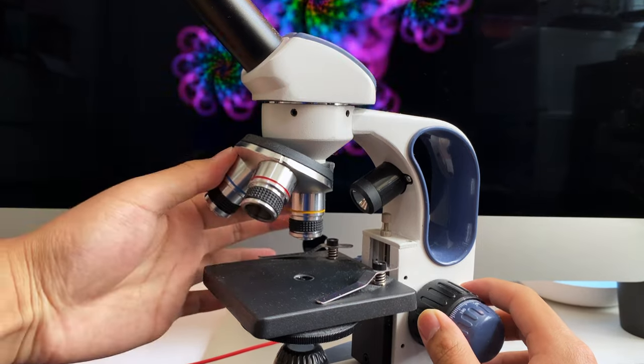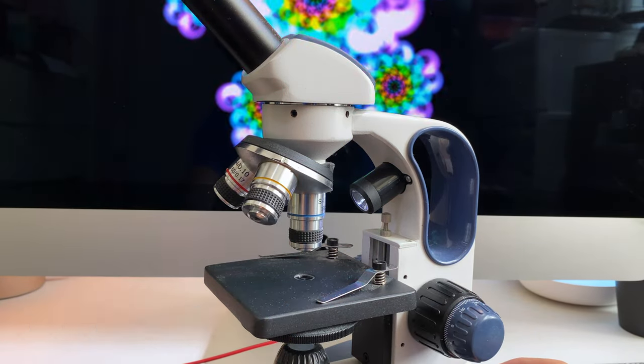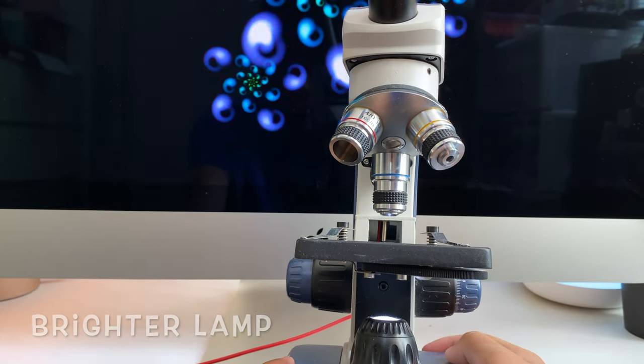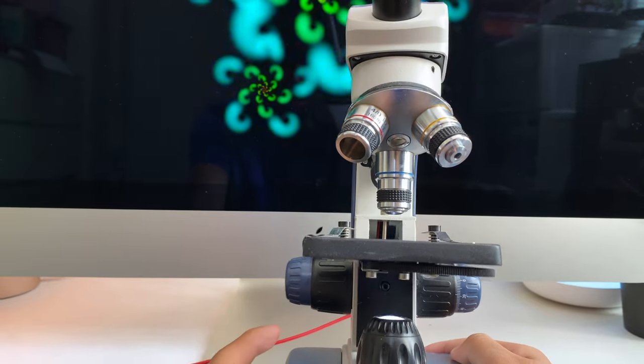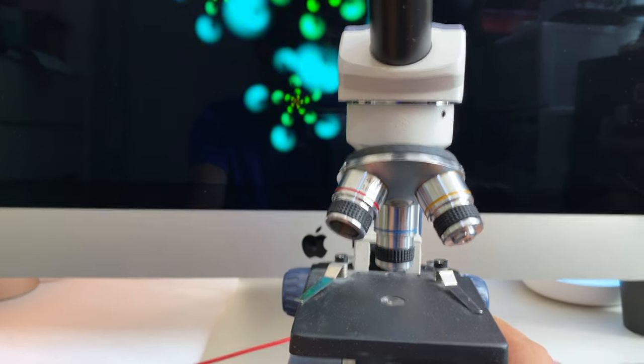Its bigger brother, the SW200DL, also has the same objectives, only it's the standard DIN type, so it will have better image quality. It also has an eyepiece and a slightly brighter lamp, plus a lamp above for what that's worth.